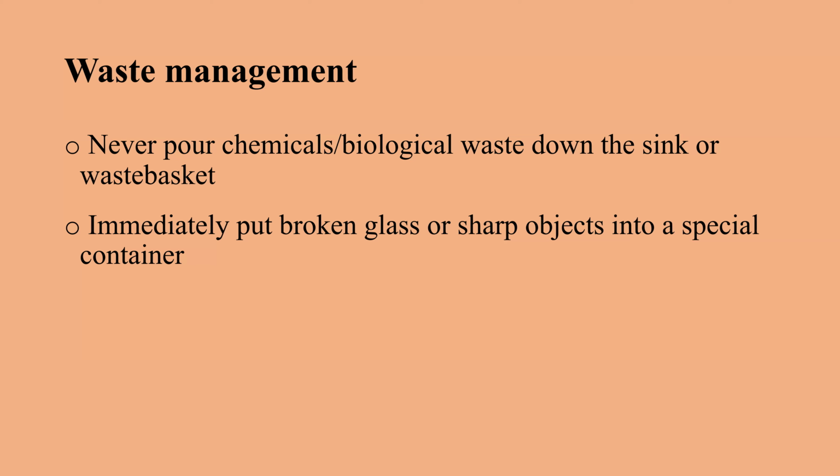Glass is one bag, and organic and bacterially infected material has another plan for waste management. Chemicals have an additional way of utilization. It's important because they should be located in different places.